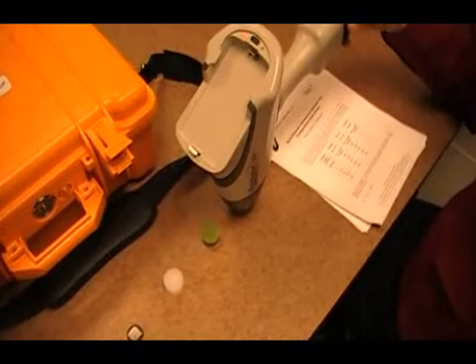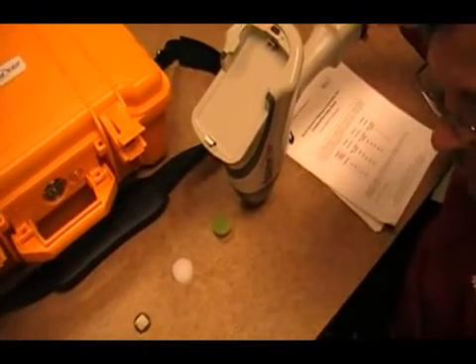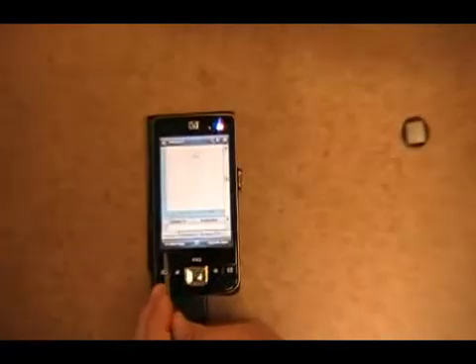And then you move the unit. Again, there's a laser there. And you have approximately five seconds to move your unit to the next standard. Go back to the spectrum so you can see it.